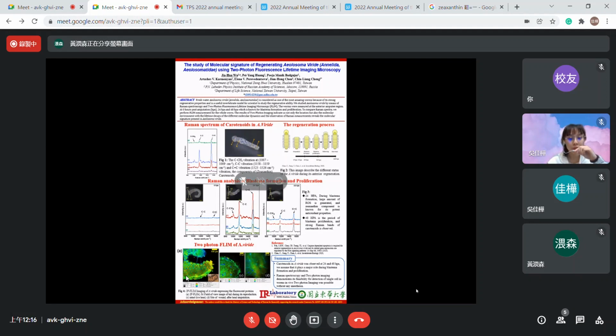Then let's move on to the last figure in this poster, figure 4. Figure 4 has 3 pictures. These 3 pictures are all expressing the fluorescent proteins. But what's the exact component of that shining spot? We are now endeavoring to understand it.